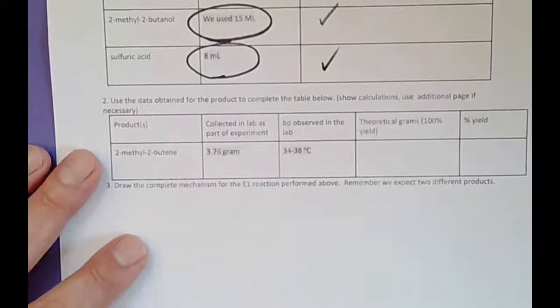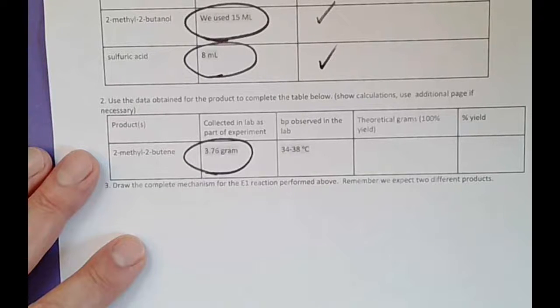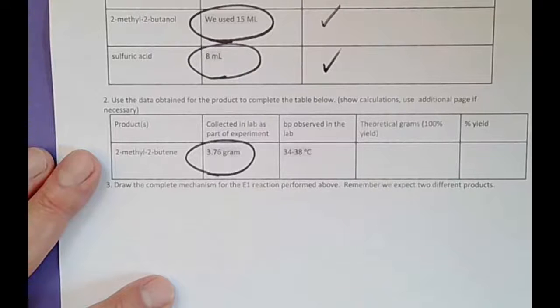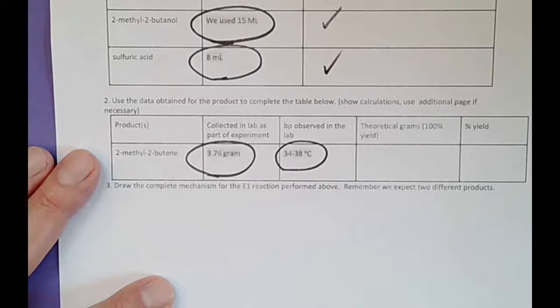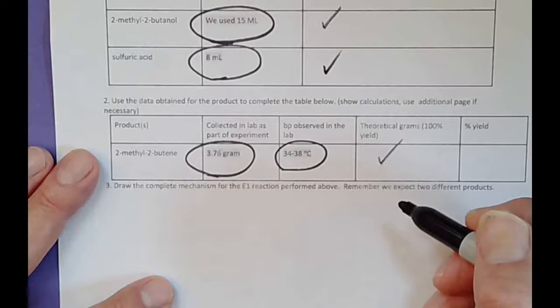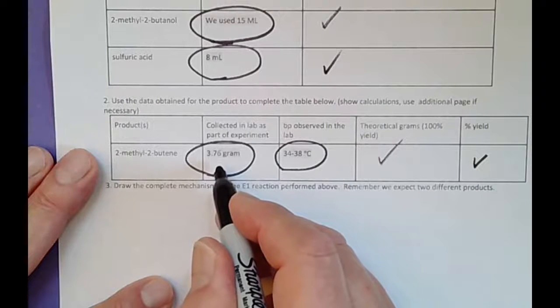Then we make the product. When we went to the lab, we collected 3.76 grams of the product, which was the combination of the two products. The boiling point we observed was 34-38. And then like SN1, we have to calculate the 100% yield from the moles, and the percent yield based on this number.